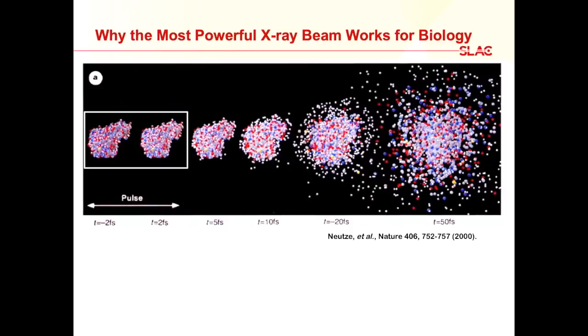So very, very short pulses of X-rays, and then the sample is just obliterated. That allows us to put way more X-rays in this short pulse than we would be able to do in a long pulse, allowing us to get much better, clearer images by packing all these X-rays in a short amount of time that would not be possible to do if the measurement was longer.